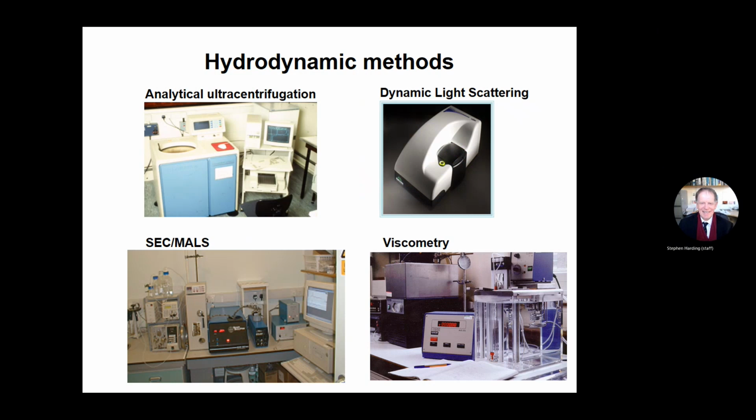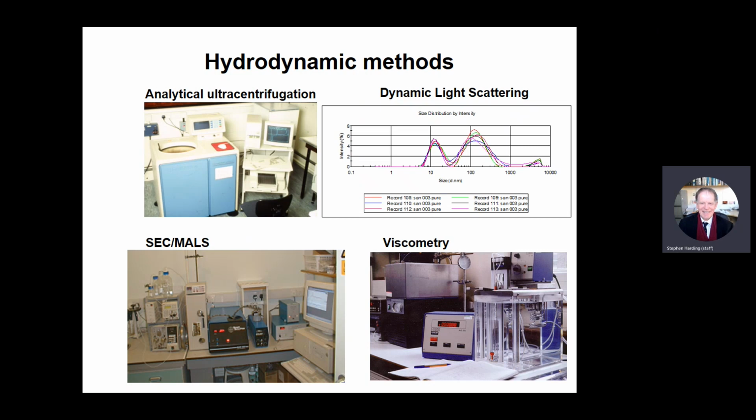And then this type of instrumentation appeared after the 1990s. This is the Malvern Nanosizer, Zetasizer. It's quite small, so everything is boxed in here. The laser and the detector, and this is where the sample goes in this box here. And that's the switch. This is all linked up to a computer. It's all computer controlled. That we'll see when we go over to the NCMH in a minute. And these are the sort of plots that come out.